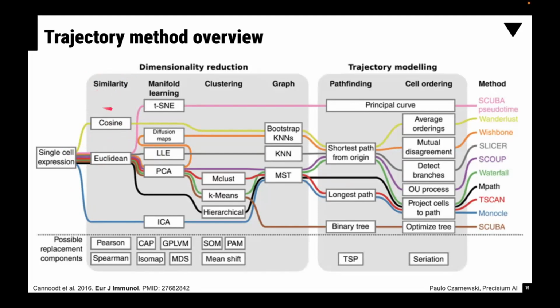One of the ways you can try to measure this is by looking at the manifold. Are you using the PCA embeddings, the harmonized embeddings, the UMAP, or the ICA? There are different embeddings that you can use. As a general guideline, you should always try to use embeddings that have more dimensions than UMAP or TSNE. TSNE and UMAP are good for visualization of your trajectories, but usually you should use, for example, the harmonized embeddings that have removed batch effects, or diffusion maps or other types of embeddings that are multidimensional, not only two-dimensional.